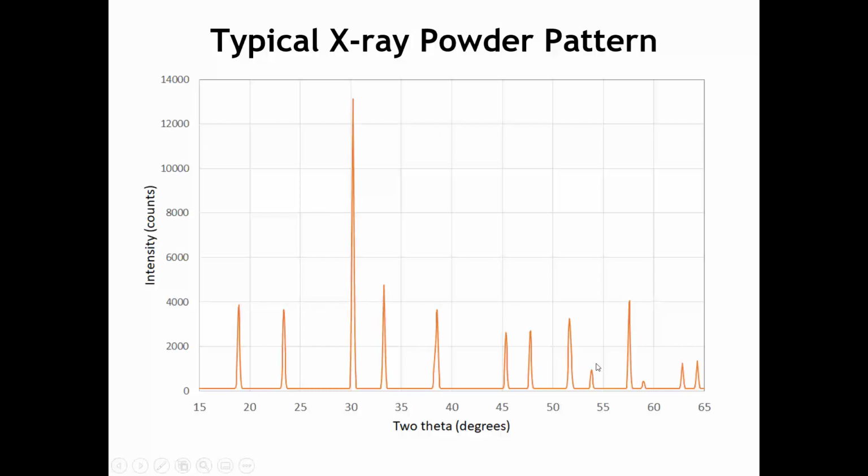But when you look at this powder diffraction pattern, I think it should be kind of obvious. It's not so easy to look at this and say, oh, that corresponds to a square reciprocal space lattice in a certain direction. So we cannot very easily look at a powder diffraction pattern and tell if a crystal is hexagonal or tetragonal or monoclinic. So how do we go about assigning the indices to the peaks?